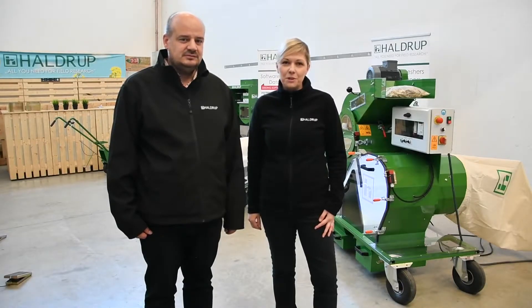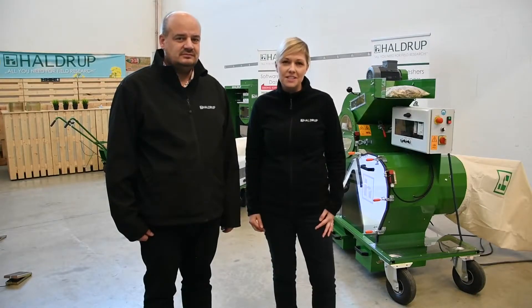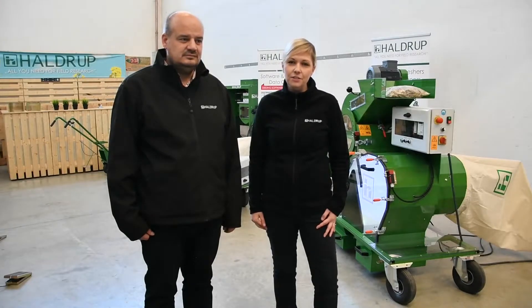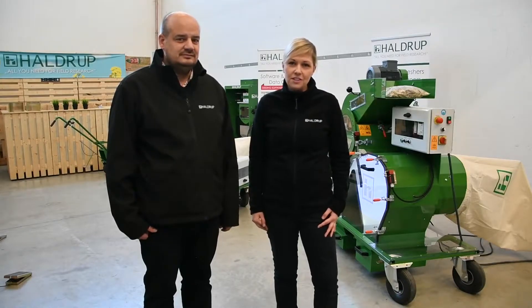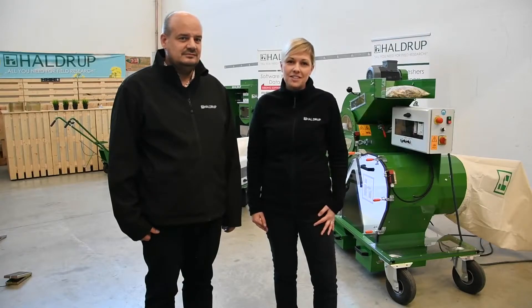Nowadays we offer in our product portfolio different laboratory machines, which range from simple single-ear threshers to complicated threshers for bundles, or even machines available in a trailer version where we have a compressor as a source of power. These machines are offered either as table threshers or in mobile versions on four wheels so that you can move them around the site.